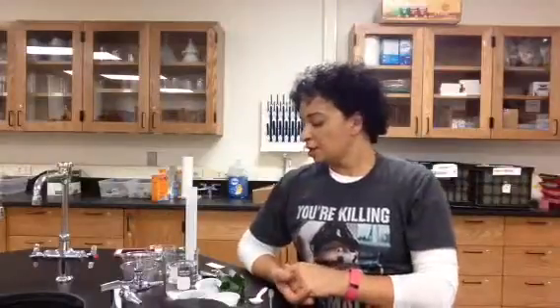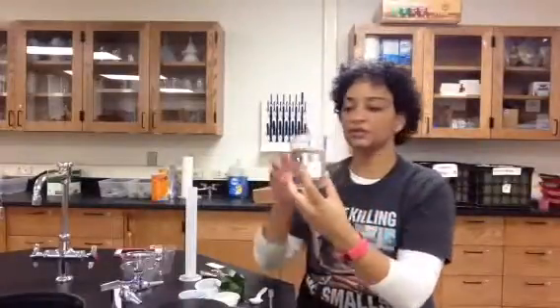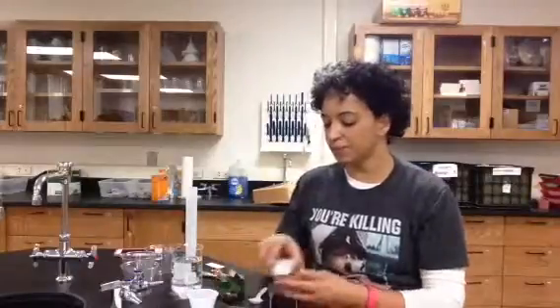So, you have a number of supplies when you get back to your lab. First thing you're going to want to do is get your beaker and measure out 300 milliliters of distilled water. Not sink water, distilled water. Okay? Next thing is I'm going to take my empty sauce cup. This is my tare cup. I'm going to put it on my balance and zero it out.